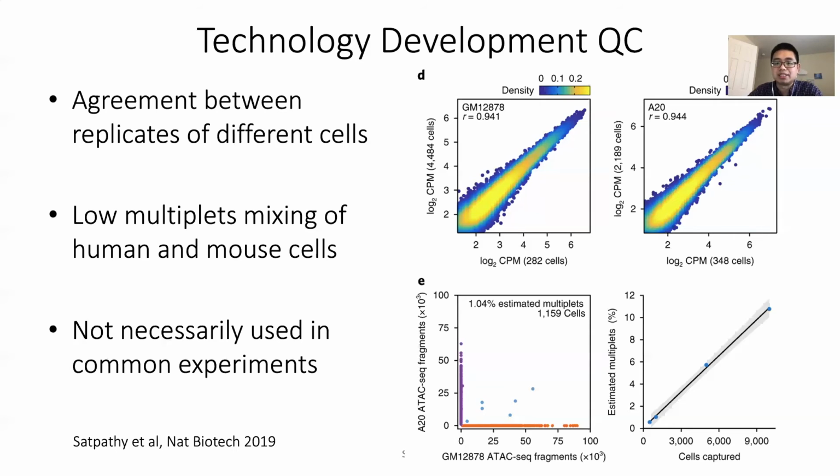The number of cells per droplet actually follows a Poisson distribution. To minimize the number of cell doublets, the single cell suspension is loaded into the microfluidic device at a very low concentration, making it very unlikely to have two cells enter the same droplet. But one thing is that most of the droplets are fully functional. They contain the barcoded beads and also the reagents, but they do not receive a cell, and therefore they are wasted. So there are other methods, for example, cell hashing, by labeling the cells from different samples with a barcode first, and you can pool cells together and overload the 10x machine.